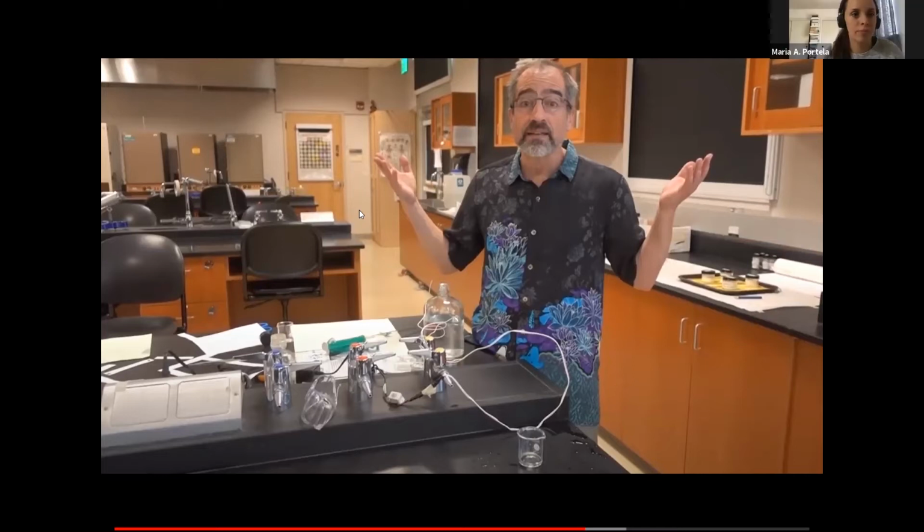No, because remember that like dissolves like. Polar things don't usually dissolve in non-polar. Do you think it's going to conduct electricity? No. Why is that? Because they will not dissolve or dissociate in a non-polar solution. There are no dissociated ions in the solution. They're all still just holding on to each other in their crystals. So there are no free ions to conduct electricity. So let's see what happens.